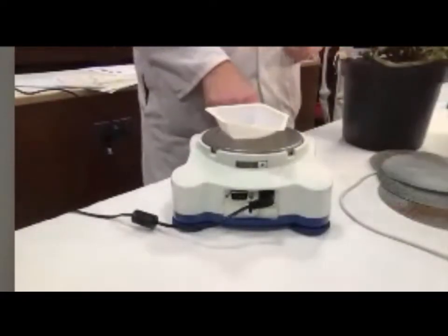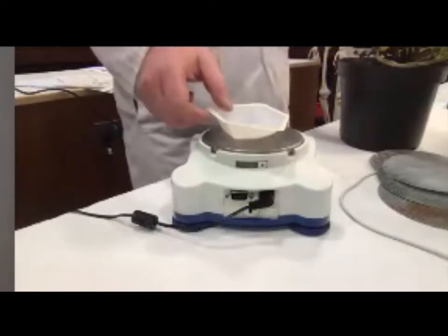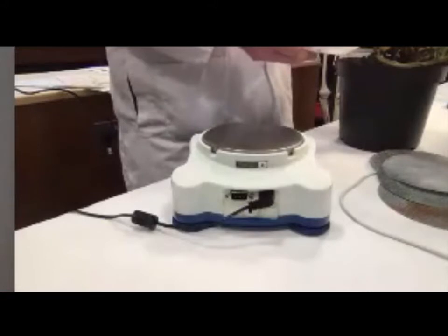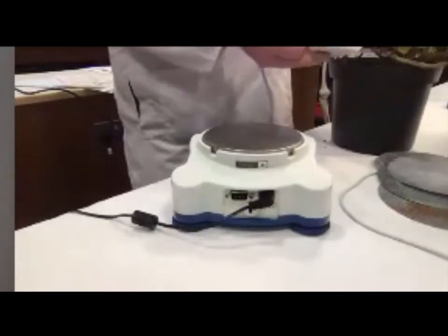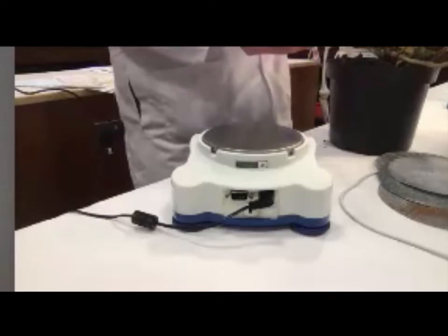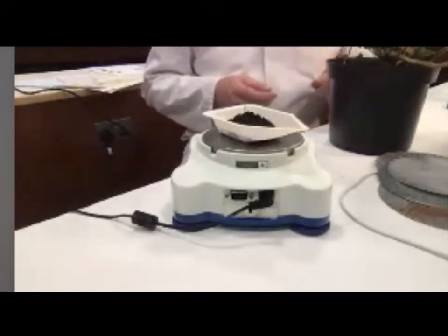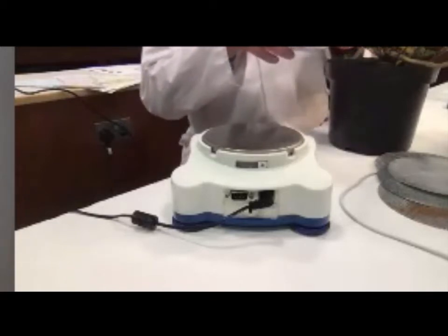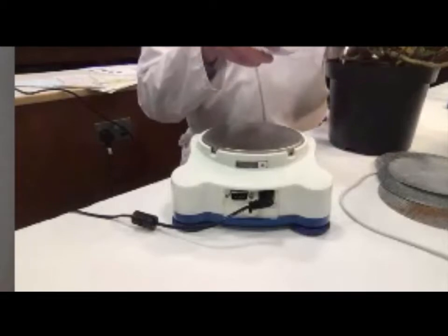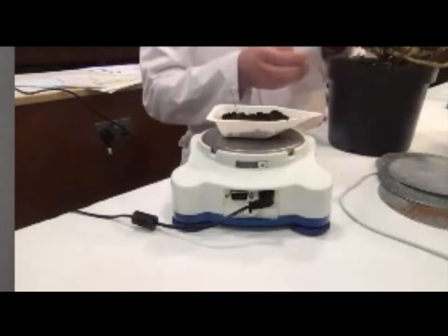What you're best to do is to measure out a quantity. You want soil, but you don't want big stones, so we just leave those out. You've probably never seen anybody stick a spoon into a pot plant before. I use just ordinary cheap spoons as big spatulas, because spatulas are often never big enough. You don't need a lot. I'm just going for around 50 grams.